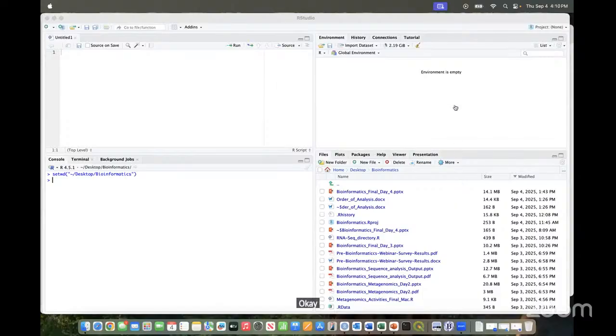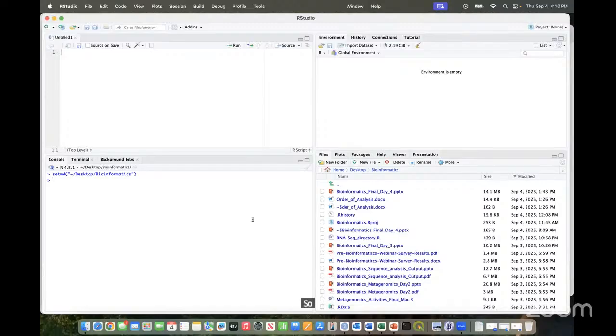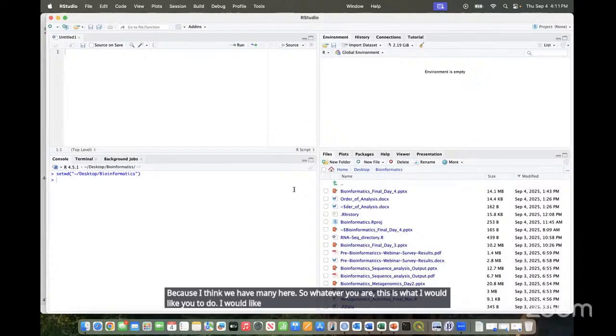Okay, I think we still have a problem here. So this is what we're going to do, because I think we are many here. Whatever your situation, I would like all of us who are struggling to be in this directory now.